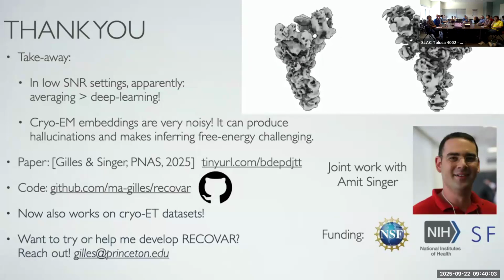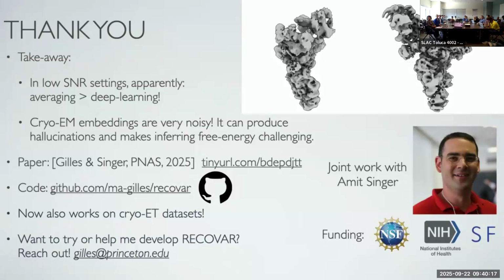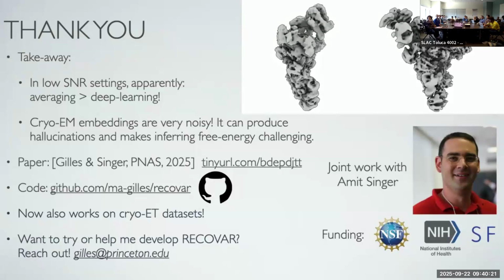Yes, so first, most methods for continuous can be applied to discrete. Certainly mine can. In principle, it feels like it should be better to treat the discrete as discrete. So basically, the discrete versions use some kind of clustering instead of some kind of dimensionality reduction, and that seems to me to be the correct thing to do.